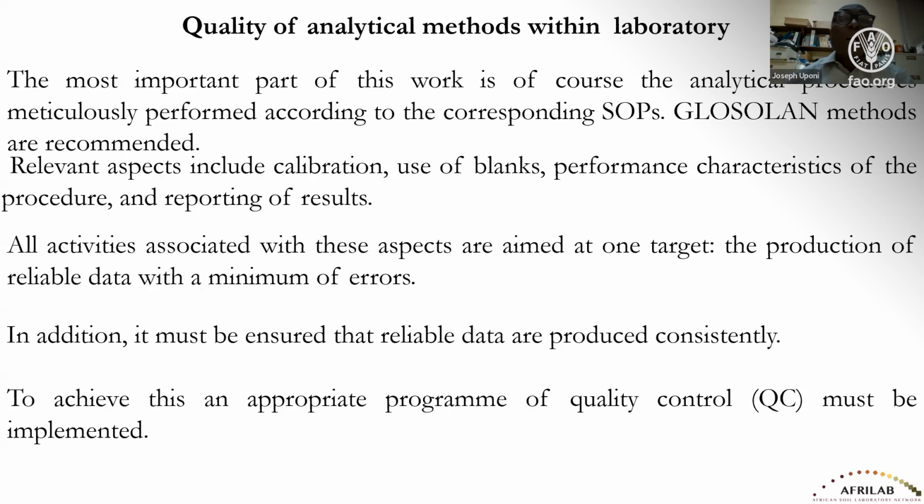Relevant aspects include, in the SOPs, you find information on calibration, the use of blanks, and other performance characteristics. Well, blanks are very important because they help to take care of any background errors and other things that are not related directly to the analysis. You need to be able to analyze blanks with every batch of analysis that you are doing.